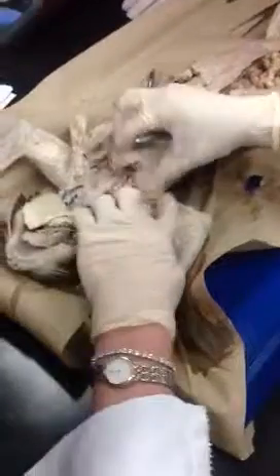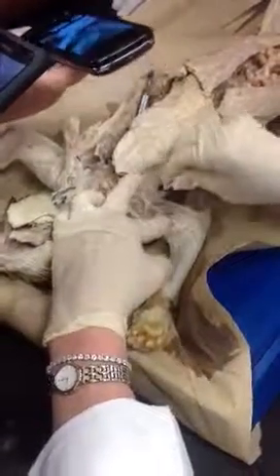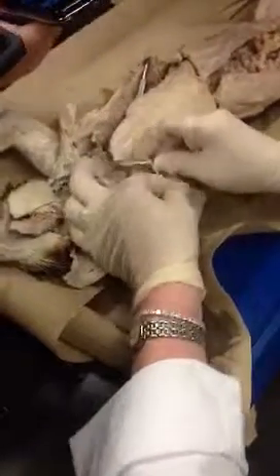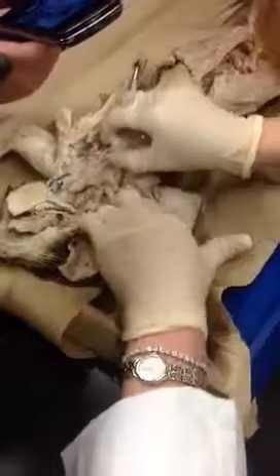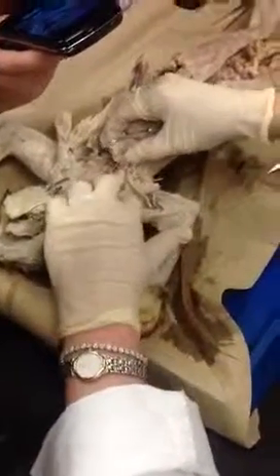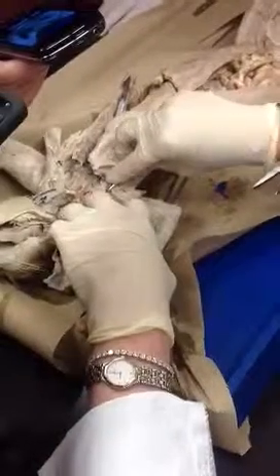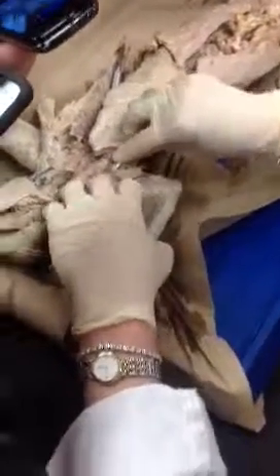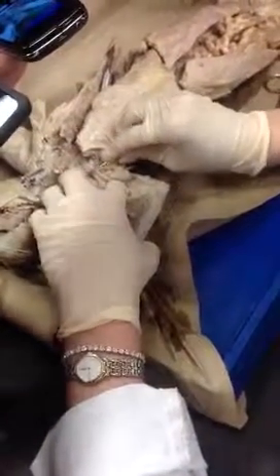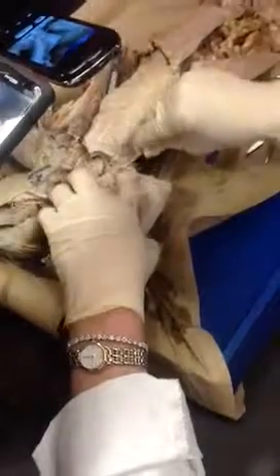So what we're looking for is one that goes pretty deep. So again, you can cut out these nerves and lymphatics if they're in your way, or just push them aside, either way you want to. Okay, do you see the vessel that's going to the scapula? See how deep that's going right there to the scapula. So there's your subscapular artery right there. See, that's a nice big one. It's going right to the scapula there, so that's your subscapular.